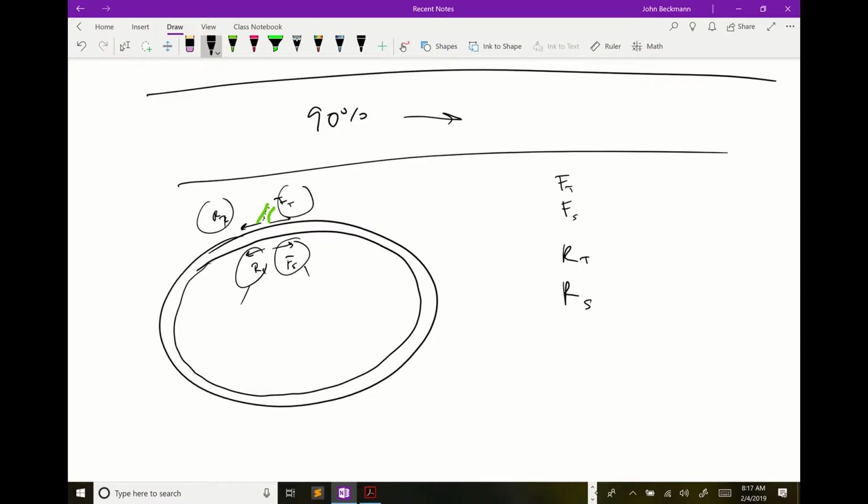And the key is that the long primers have this little region that matches, okay? And that is what creates sticky ends that can anneal. So you're essentially mimicking what a restriction enzyme does, but you're just doing it by building it into your primers. And then what happens is you actually PCR all the way around the plasmid.